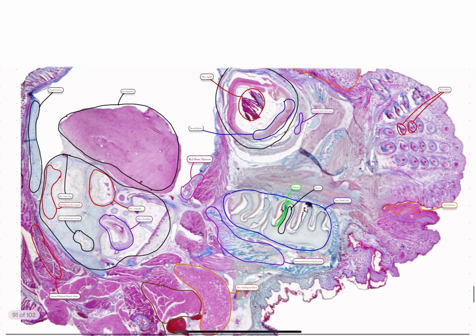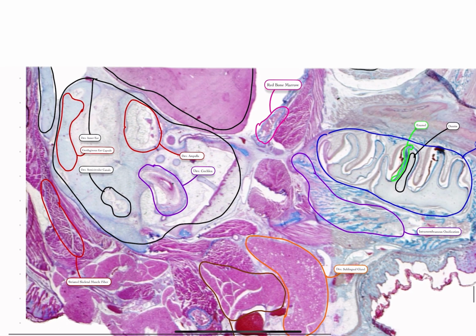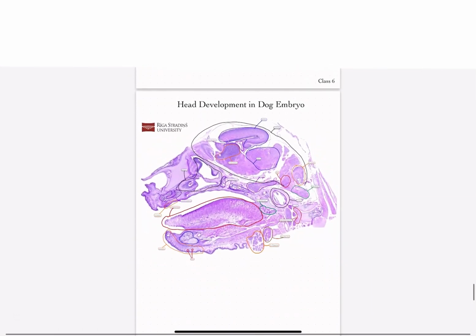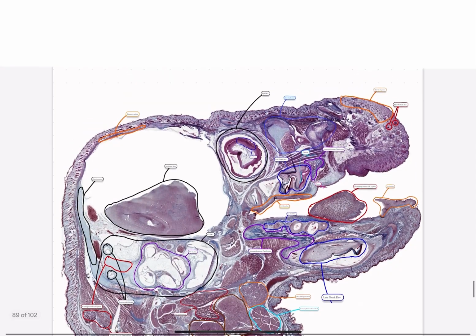It can also be towards the bottom of the head. Maybe this, unless it would be more clear if it was more zoomed in. Let's look at other areas of the head. Do we have them here? Here we go.